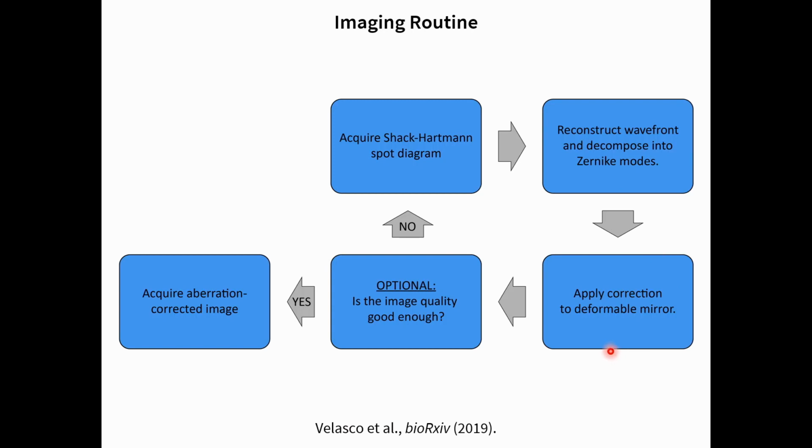Then next, optionally, you can first judge whether the image quality from this correction is good enough for you. Or you can proceed to skip the step, as I did for most of my experiments, and then just proceed to acquire an aberration corrected image.